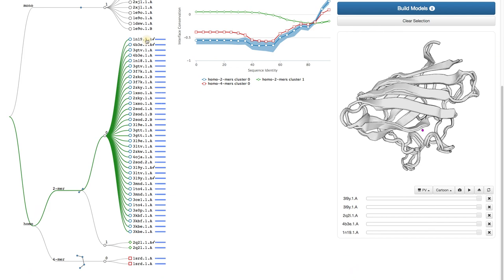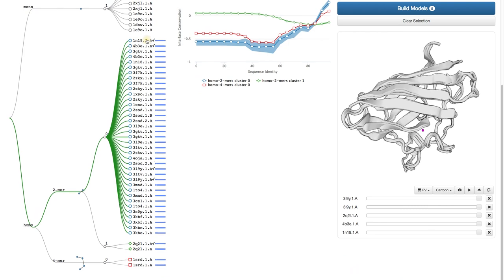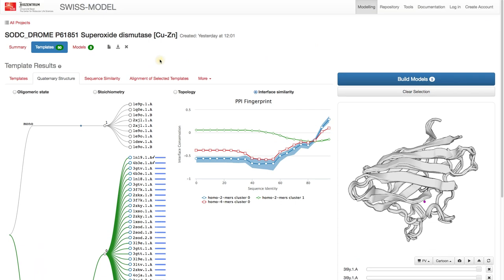You can see in the window that the tertiary structure is very similar between the templates. The last plot we will explore on this page is the Protein-Protein Interaction Fingerprint.